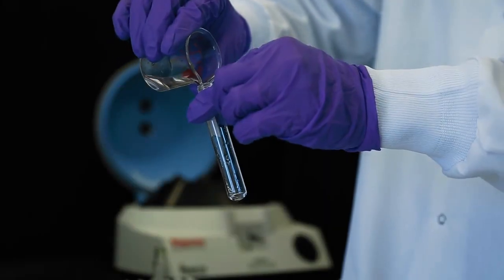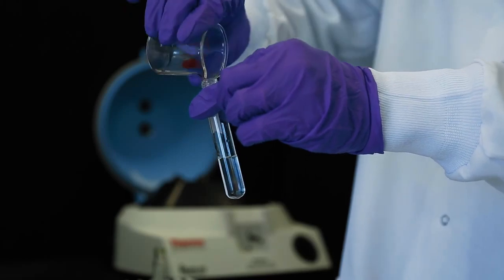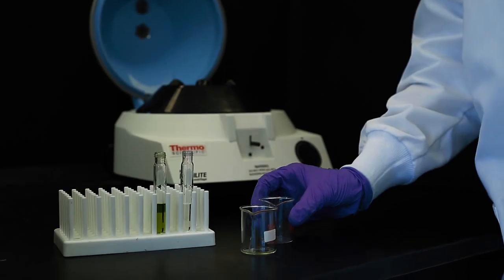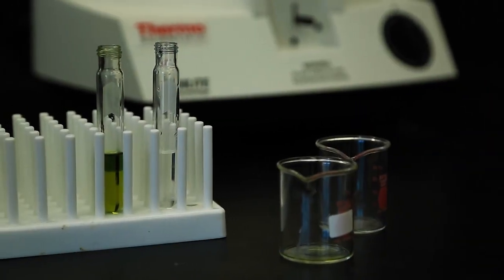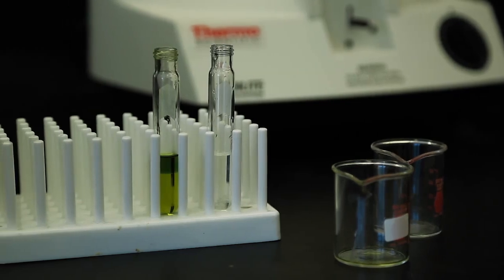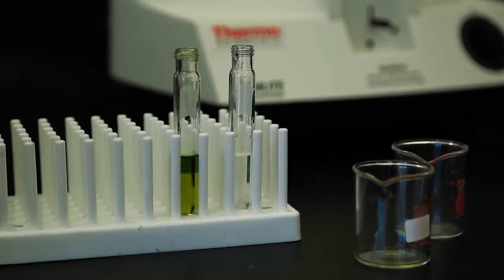Leave the test tube half empty. You need an even number of test tubes. If you do not have an even number of samples, fill a test tube with water to the same height as the sample. It is very important that each test tube has another test tube placed directly opposite it in order to keep the centrifuge balanced.